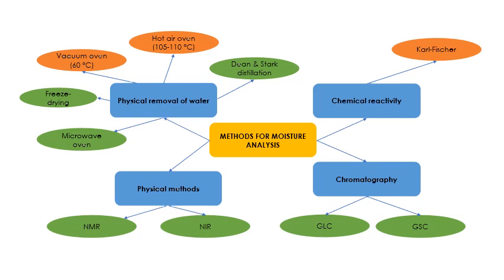For chemical reactivity, we have here Karl Fischer. I will explain in more detail later on. We also have physical methods and chromatography, but both of these methods are expensive.